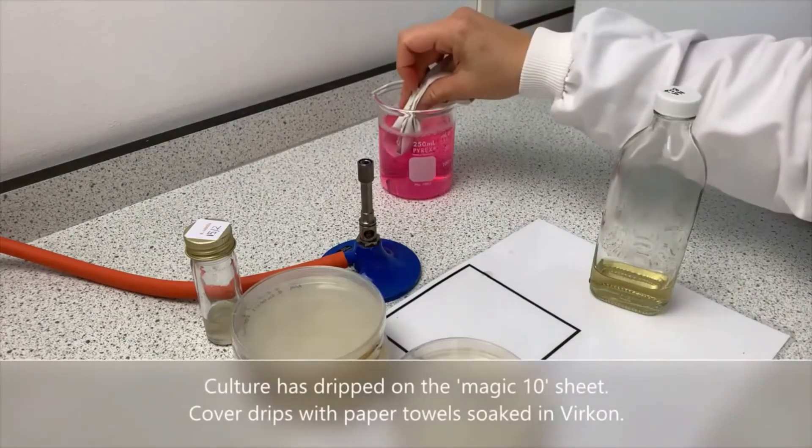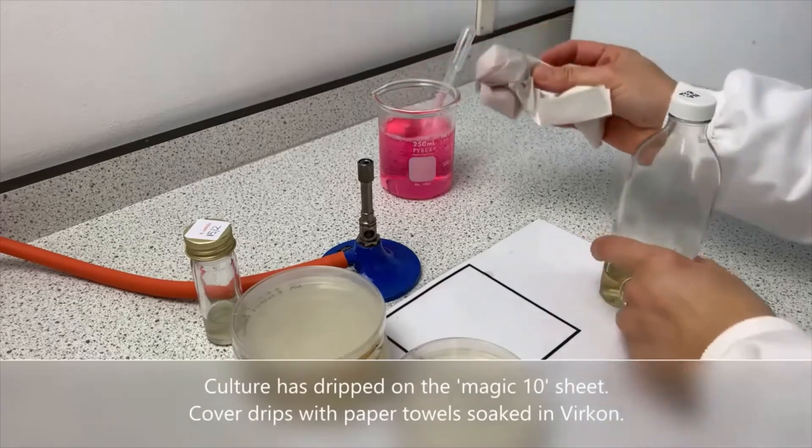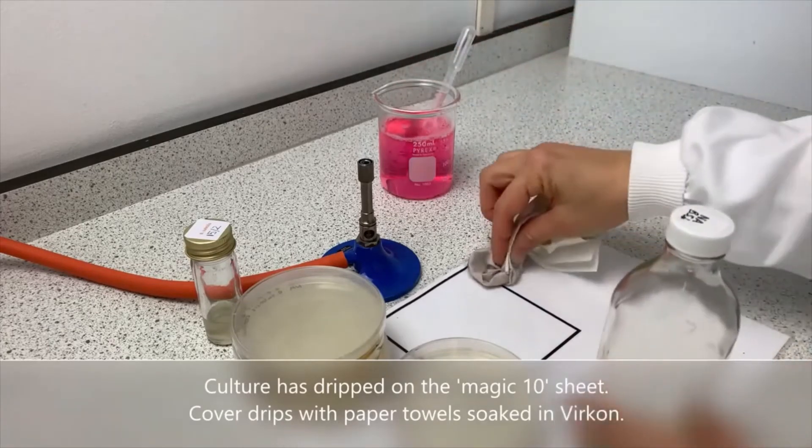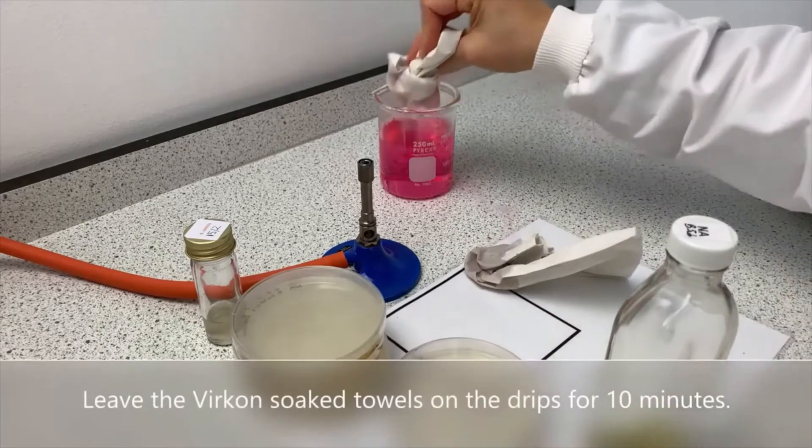Culture has dripped on the magic 10 sheet. Cover the drips with paper towels soaked in vercon, and leave the vercon-soaked towels on the drips for 10 minutes.